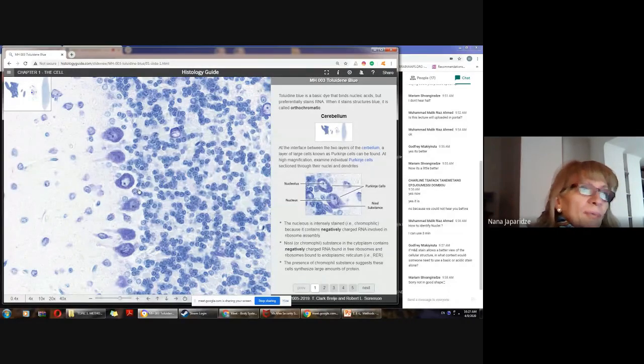But when we have, for example, the possibility to stain the neurons and to identify how structurally the cells are arranged in this or that brain structure, we usually use this type of, I mean, basophilic staining, because cells are very well visible. Nucleus and cytoplasm are very well stained.